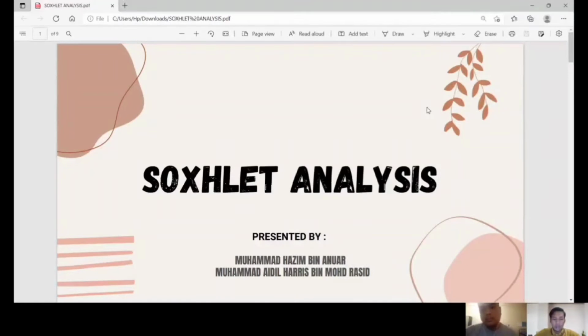Today I, with my teammate Muhammad Aidil Haris bin Muhammad Rasid, and I, Muhammad Hazim Anwar, will present about our practical project, which is Soxhlet analysis.